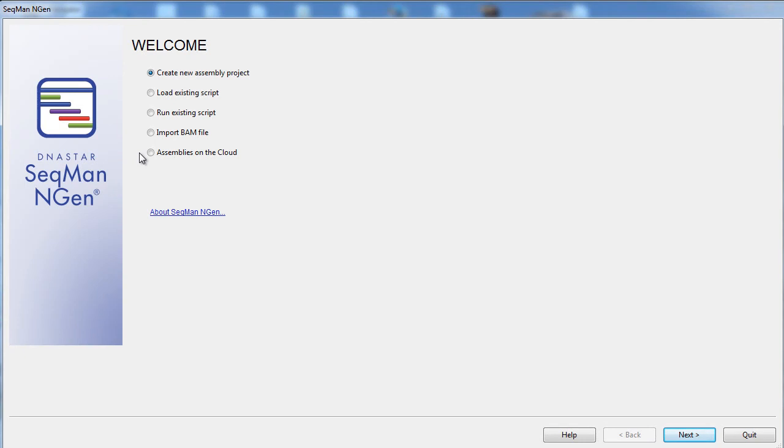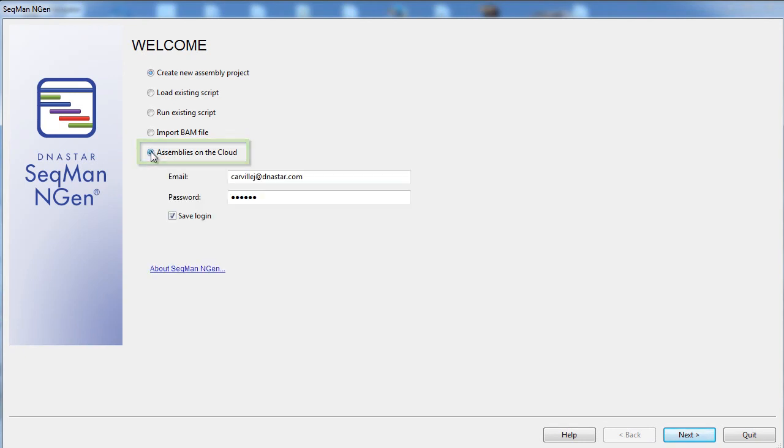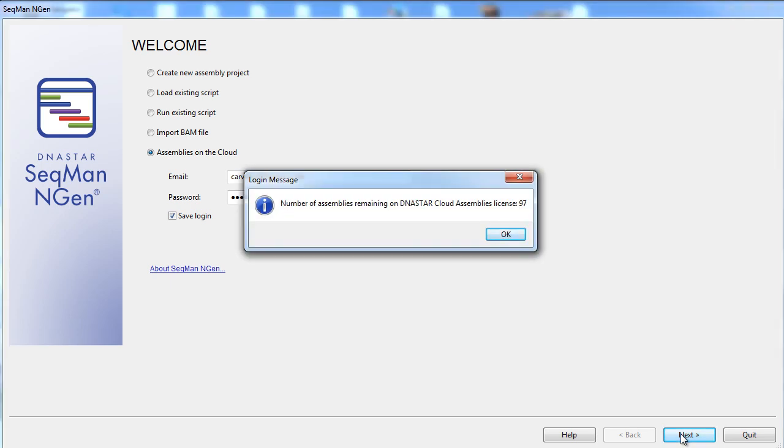Access this functionality through the first screen of the Seqman engine wizard. Enter in your login information to get started.